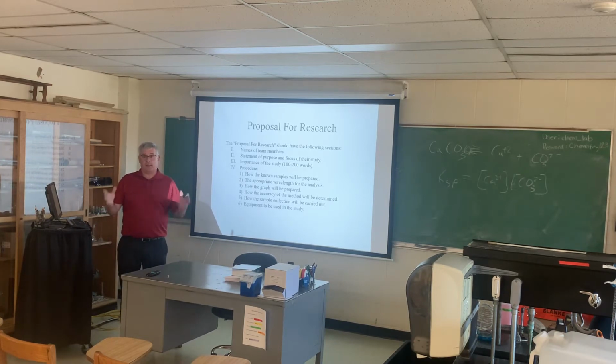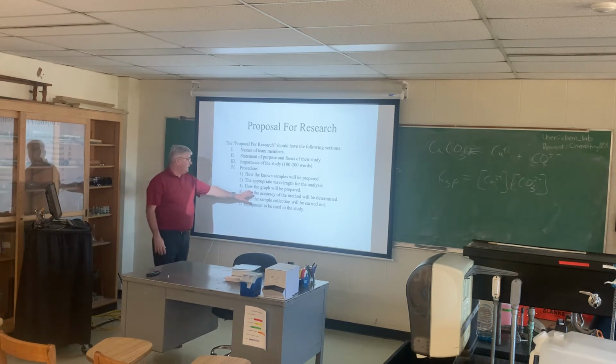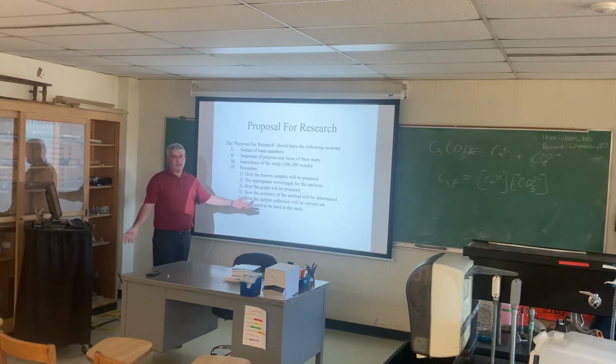We're going to do a scan of the visible spectrum and look to see where the peak absorbance for the phosphate ion is. And well, actually, when it's interacting with an indicator, we'll talk about that in a minute. And then how the graph will be prepared. So there's a graph that you have to make. It's called a calibration curve. And so I want you to discuss calibration curves, what the relationship is there. Well, you're going to use Beer's law, so that's something I would expect to read about in that statement.